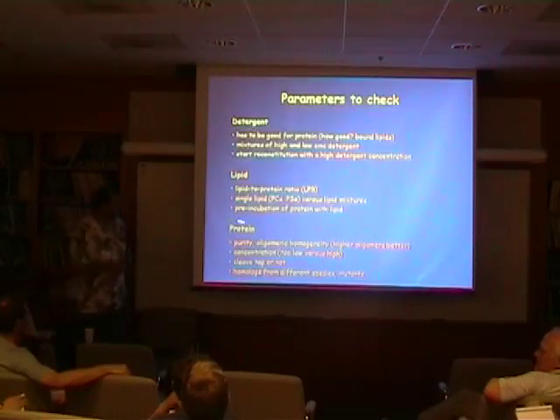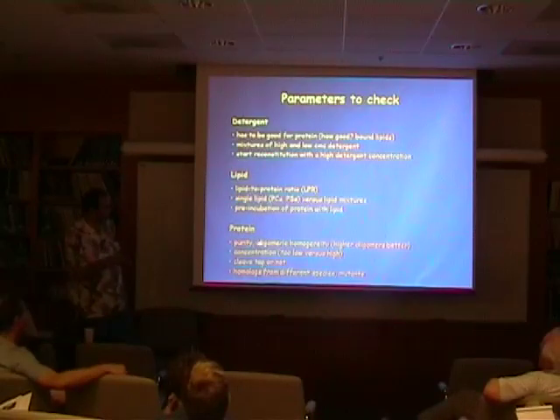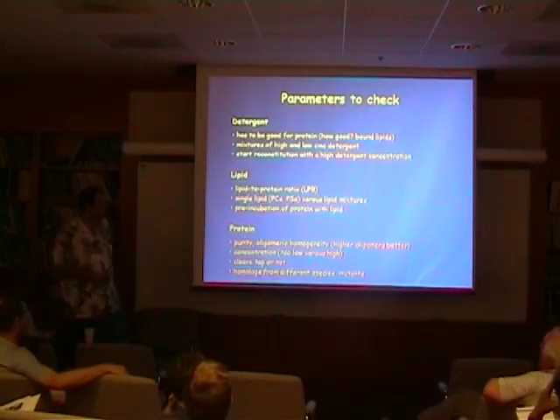And then obviously the protein is very important. It's not just the purity, but in my opinion it's also the oligomeric state. So if you have a high oligomeric state, if you have a trimer, a tetramer, it's much easier to reconstitute or to crystallize than if you have a monomer. Similar principle of virus self-assembly. Once you have a shape, it's easier to build and assemble it than if you have just a monomer. And also you want to have a pure oligomer, so that's my belief.